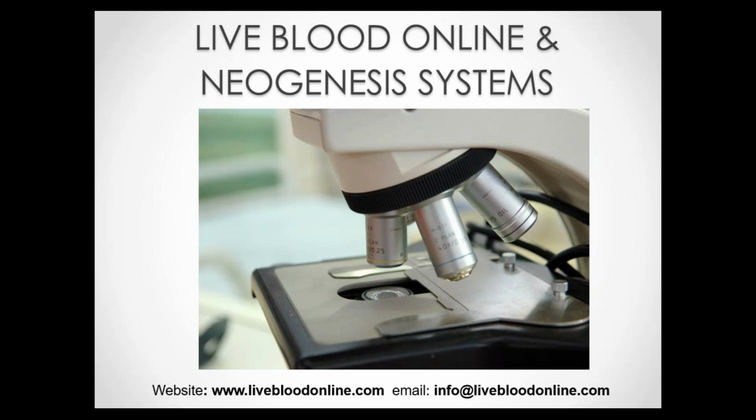Many of the anomalies that we view as being significant in live blood analysis are actually disregarded in conventional testing because they're seen as an artifact created during the staining process or as a result of byproducts of the staining process.